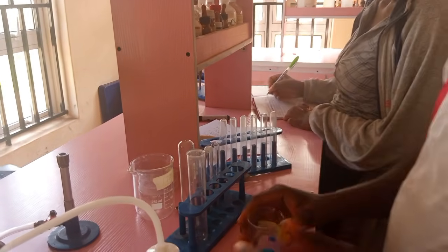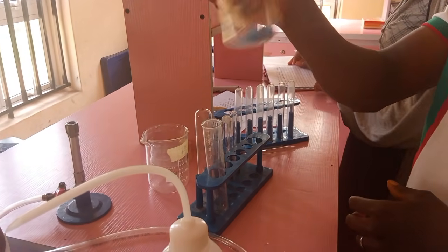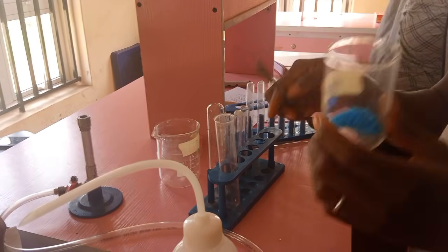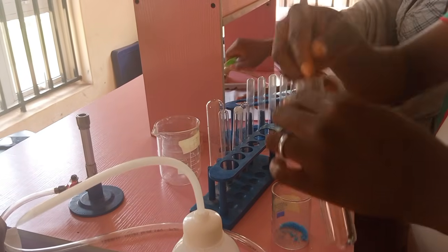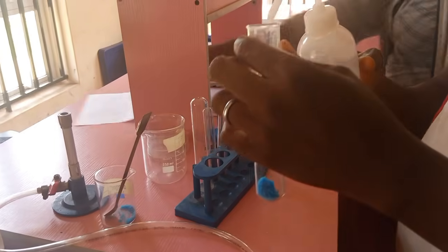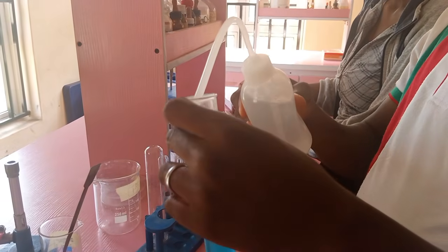Okay, let's start. The first test we are going to carry out is to dissolve this in some volume of distilled water. So I'm going to take a spatula full and dissolve it here. Then I'll add distilled water. Remember, when doing all of this, you have to be reporting what is happening. You have to report it.